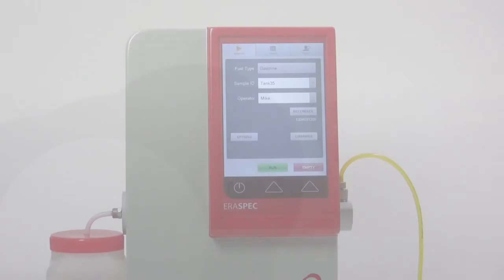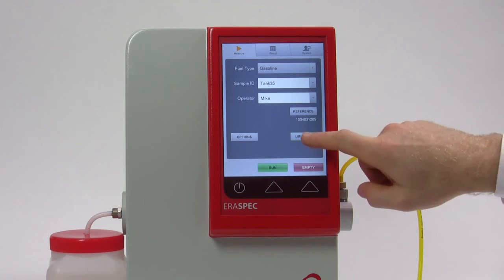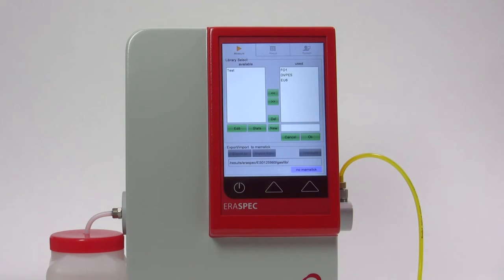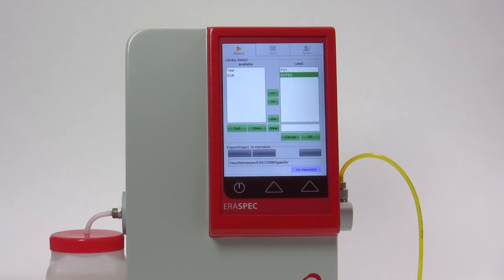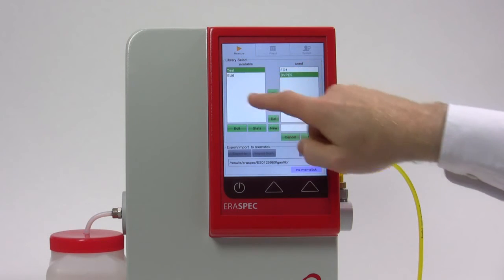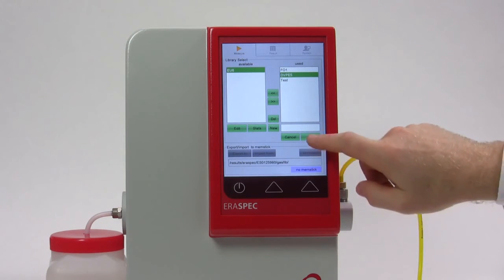The libraries can be found in the measure menu under the Select Libraries option. The box on the right called Used lists the libraries used for a measurement. All other available libraries are shown in the box on the left called Available. Use the left and right arrow keys to activate or deactivate a library by moving it to the Used or the Available box.